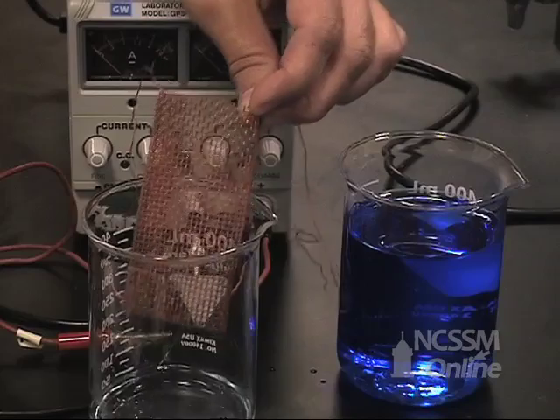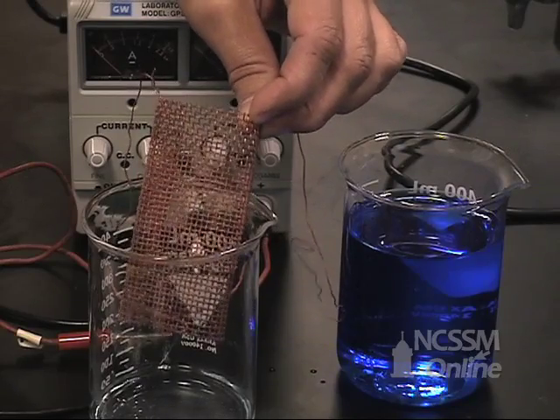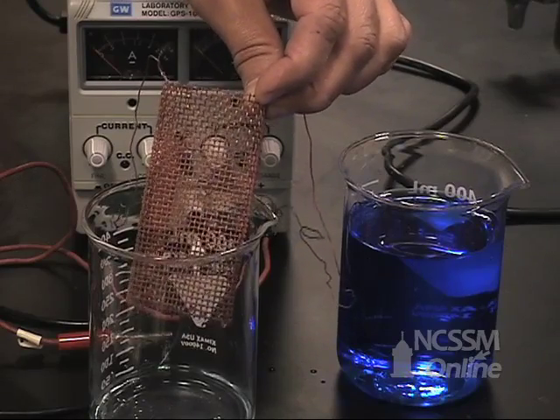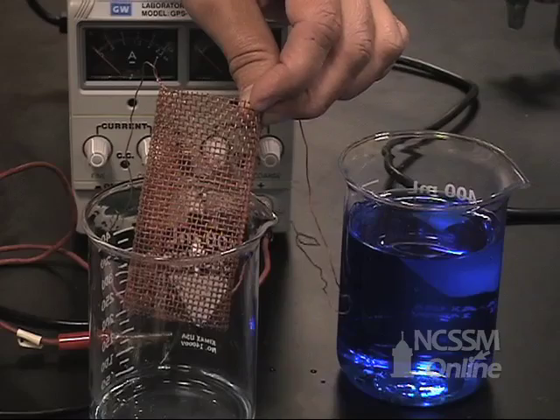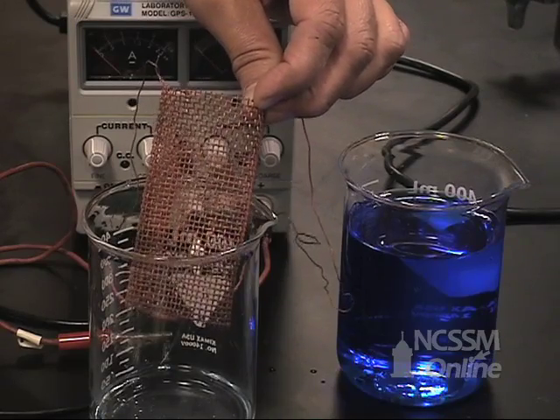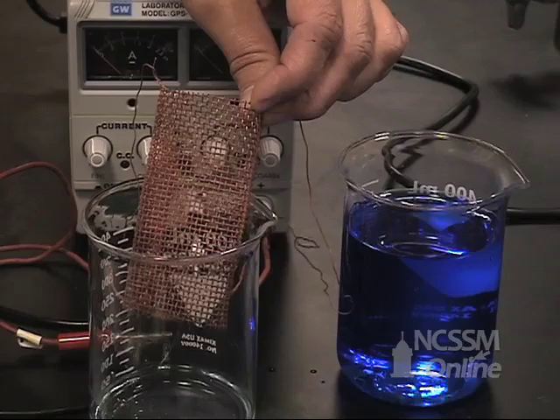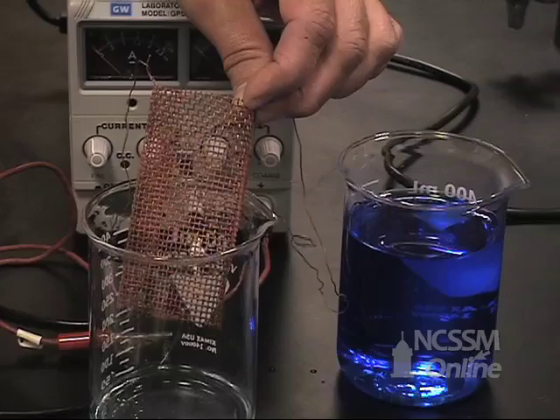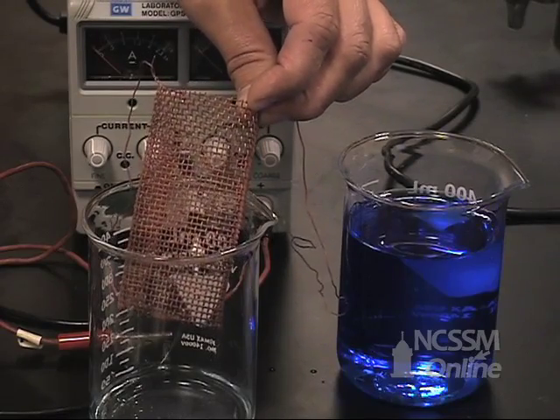We'll then remass the copper mesh. From the increase in the mass of the copper mesh, we'll be able to determine the amount of copper that's been plated on the electrode. We'll know the mass of the copper produced, the current, and the time. You'll be able to solve for the value for the Faraday.